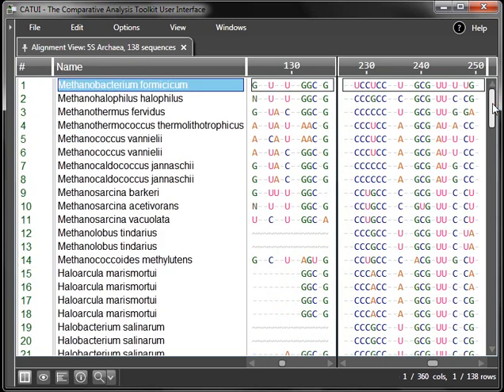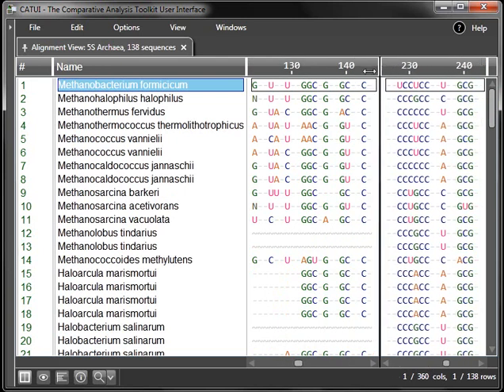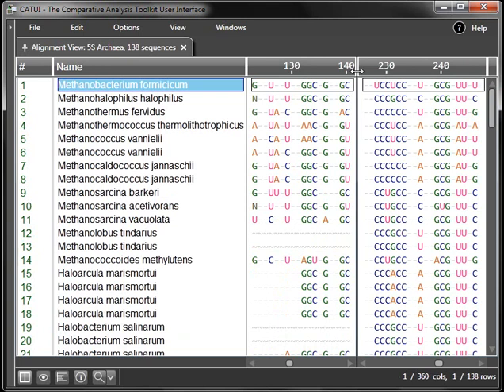By dragging the splitter in between the panes, the relative size of the 2 panes can be adjusted. In the future, this feature will be utilized to overlay structural relationships between distant parts of an RNA sequence.